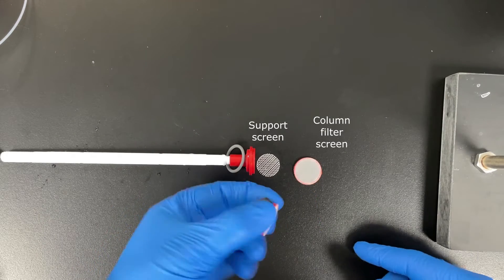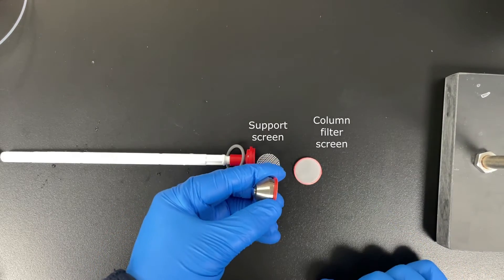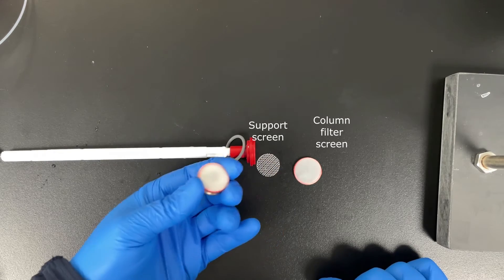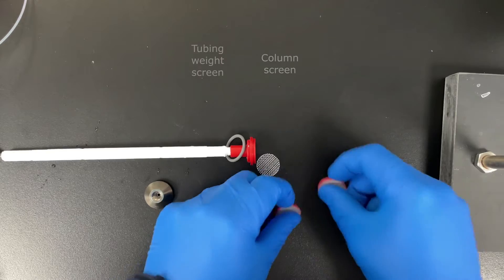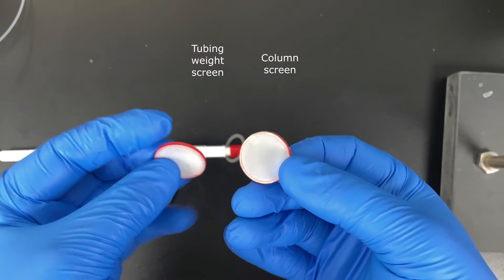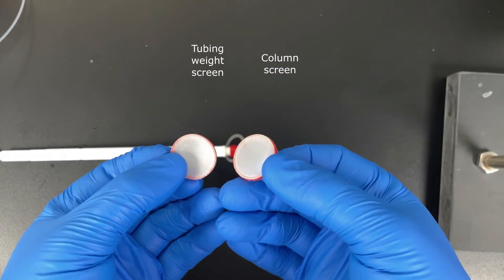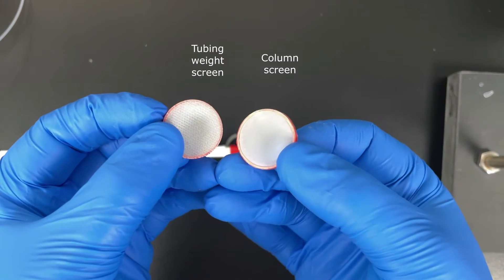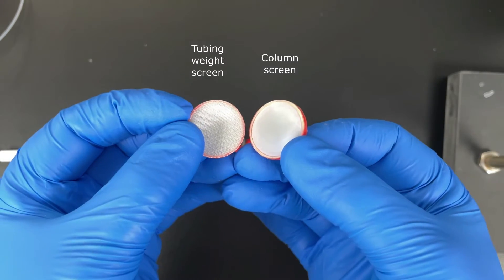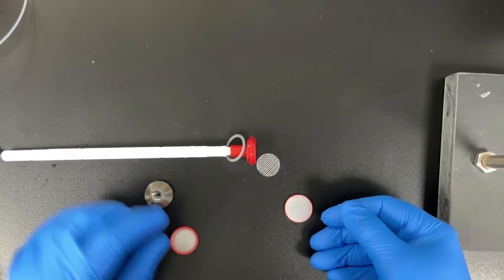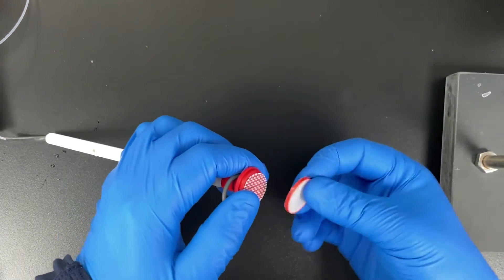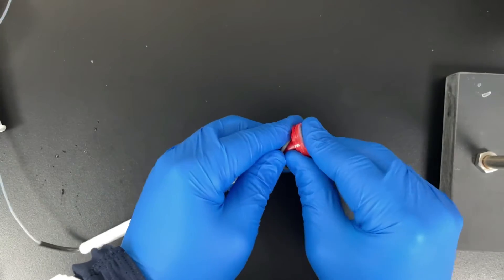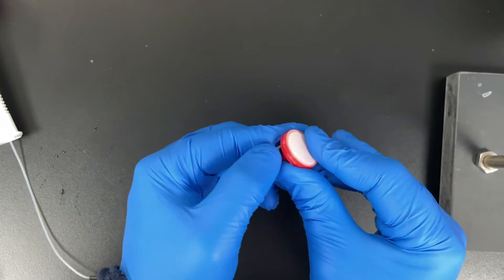You want to be careful that you're not using one of these tubing weight screens. They're the exact same size and look the same way. The tubing weight filter screens won't hold the resin back. You'll notice that the tubing weight screens are a much coarser thread than the column screen. Get rid of any tubing weight screens you might have in the lab so you don't confuse them. I've made that mistake myself.